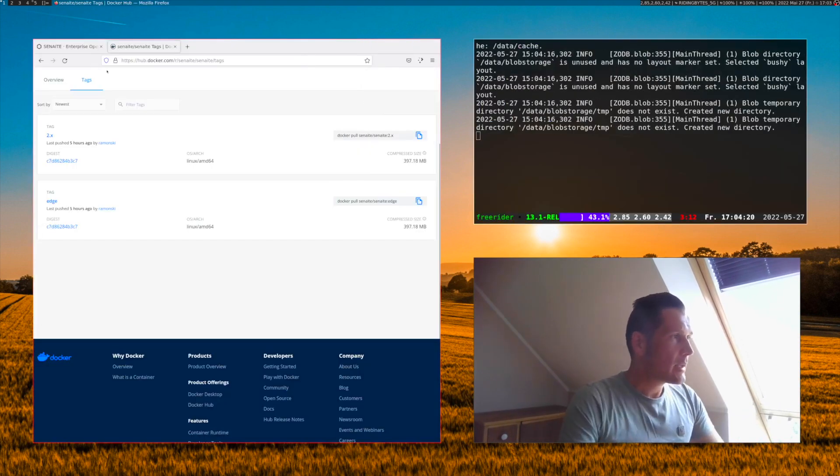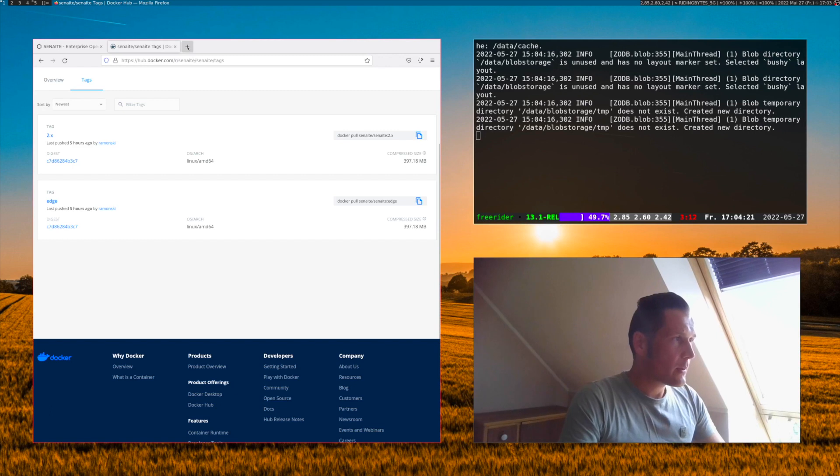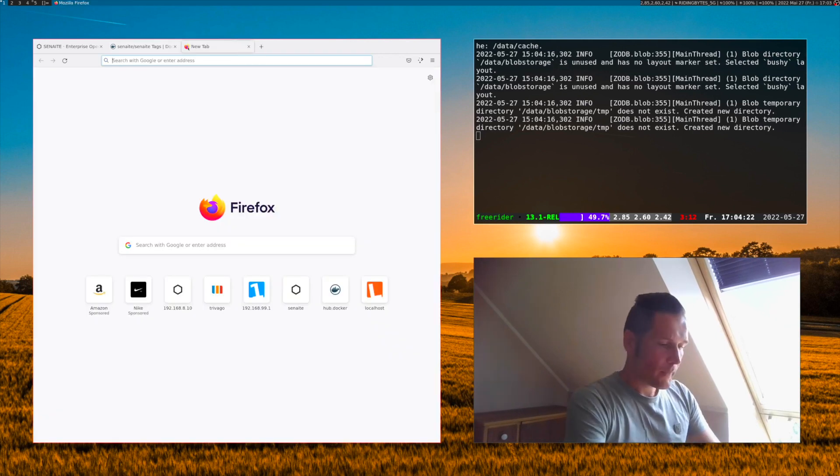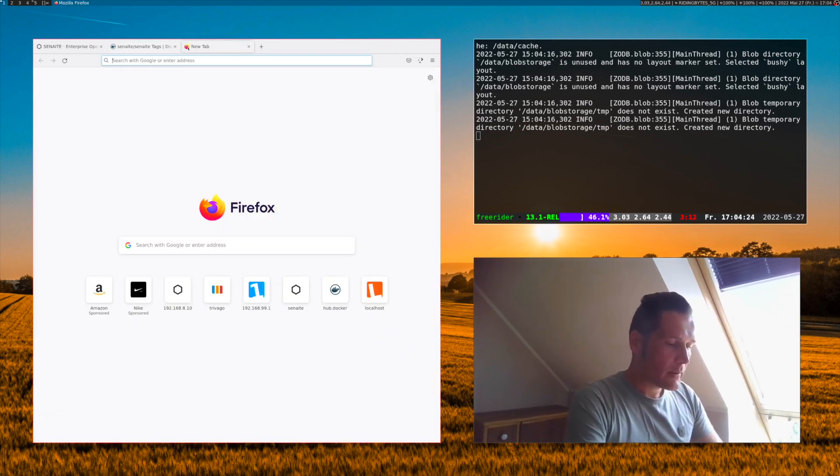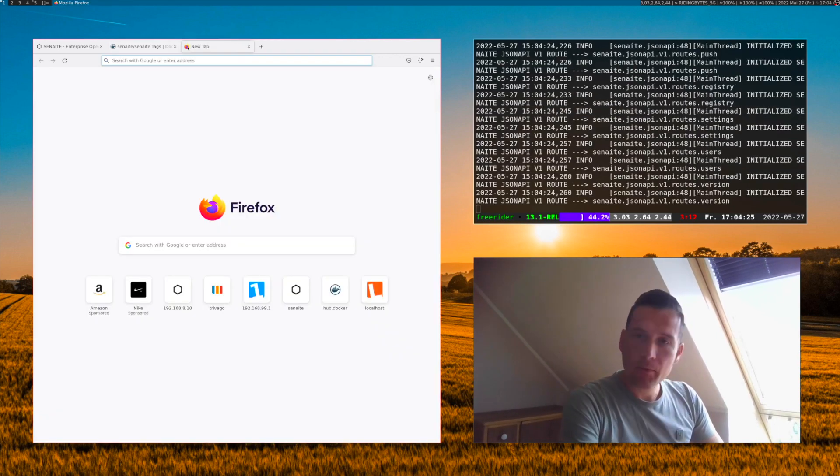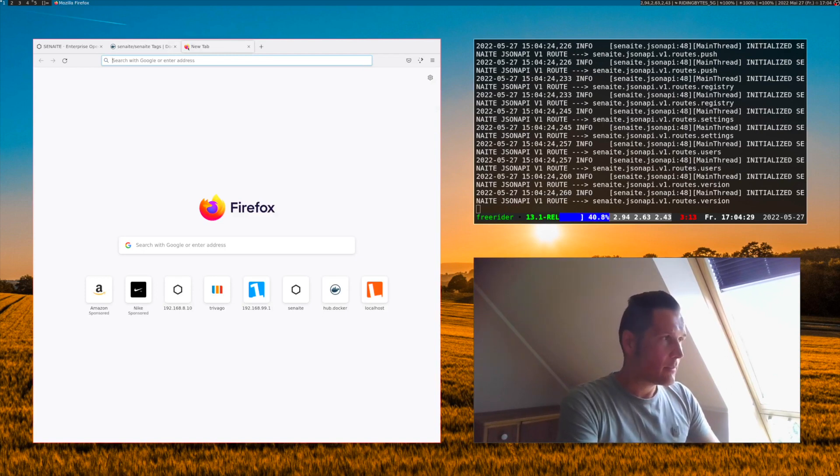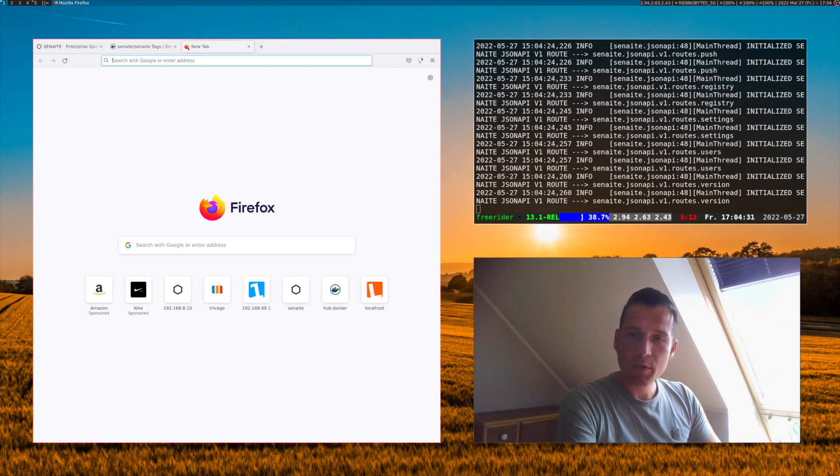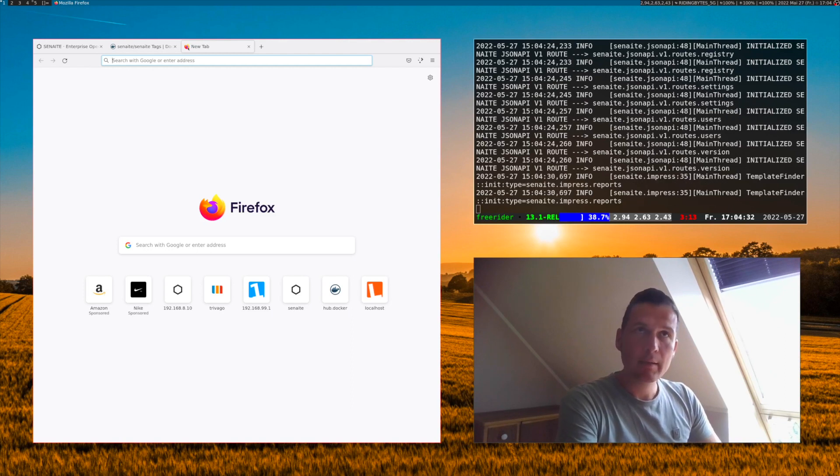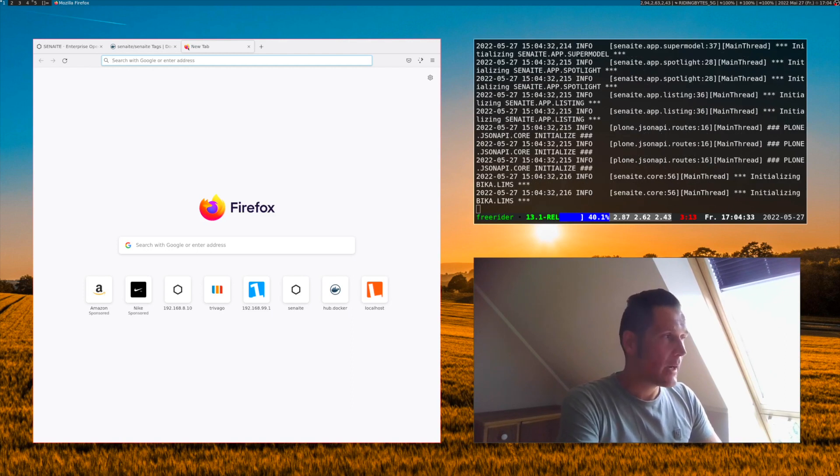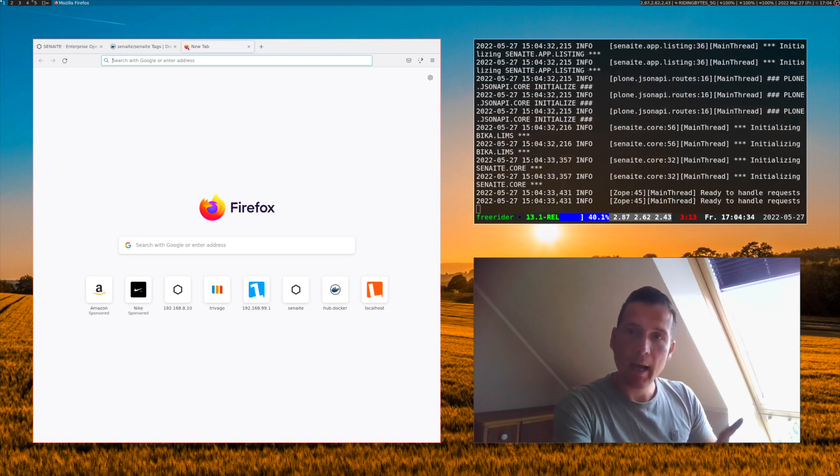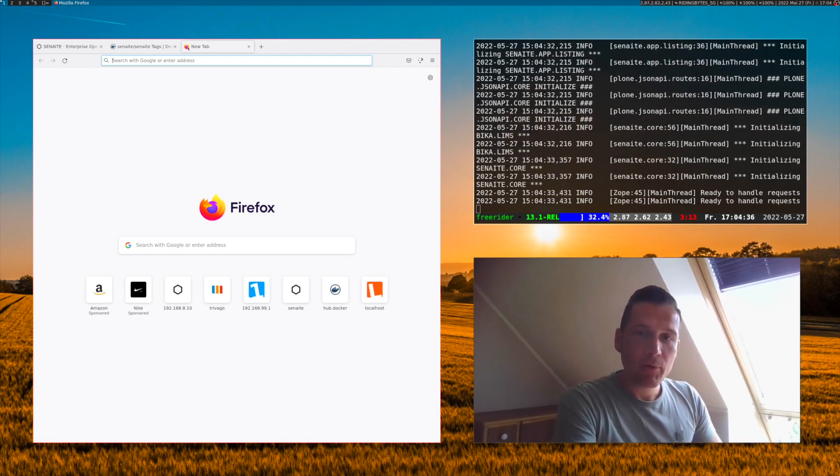We can go now to our web browser and open the address of the Docker container. For me, because I'm using a Docker machine which is running inside a VM, I need to specify the IP of the VM here.